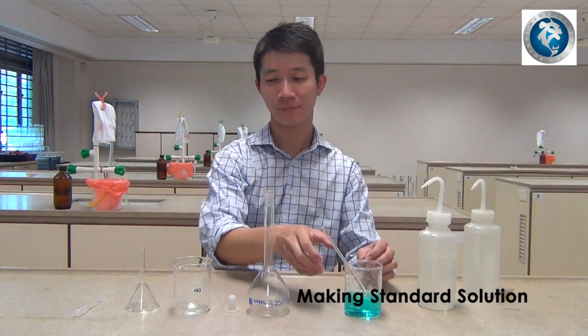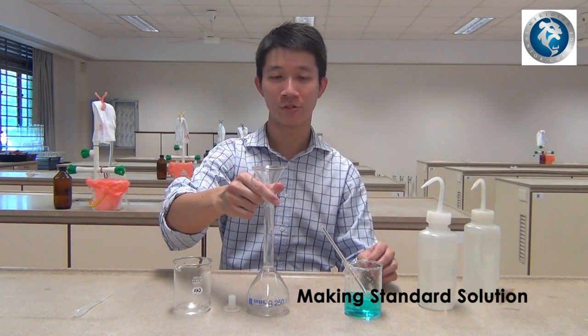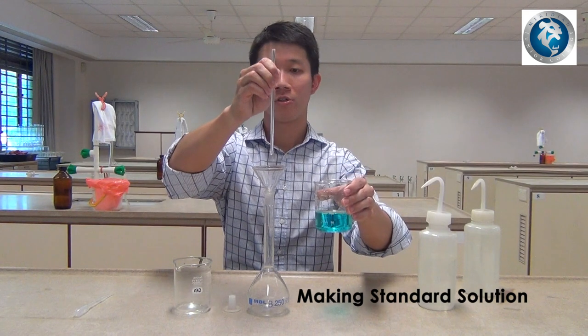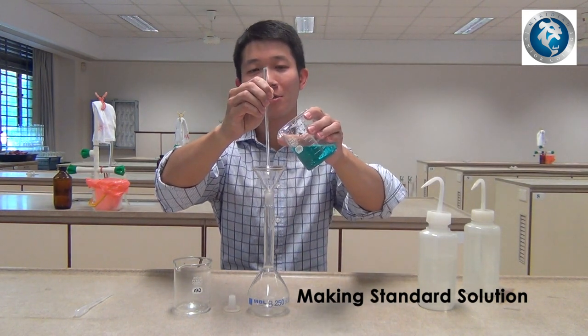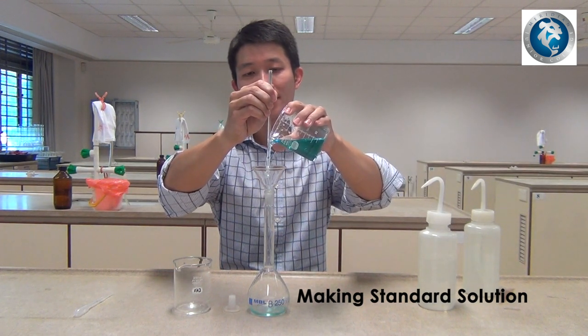Once all the solid has been dissolved, place the glass funnel onto the volumetric flask. Using the glass rod as a guide, pour the solution slowly into the volumetric flask.